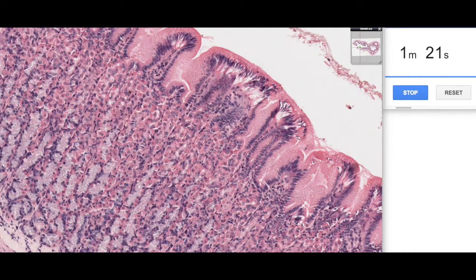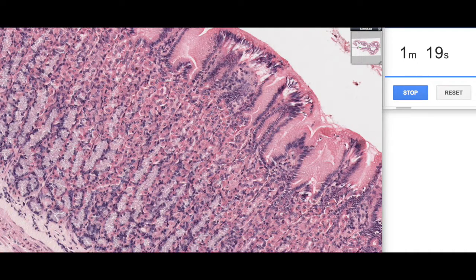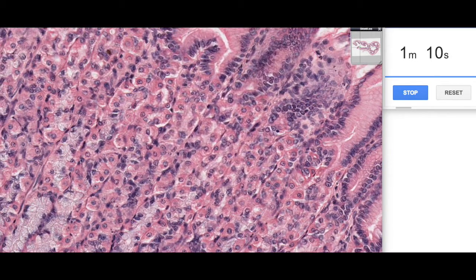Going down into the glands we find a number of different cell types. We can find mucus neck cells, which are the equivalent of the surface mucus cells. We also see these various acidophilic cells with a round nucleus very centrally located, giving these cells what is sometimes described as a fried egg appearance. These are our parietal cells.